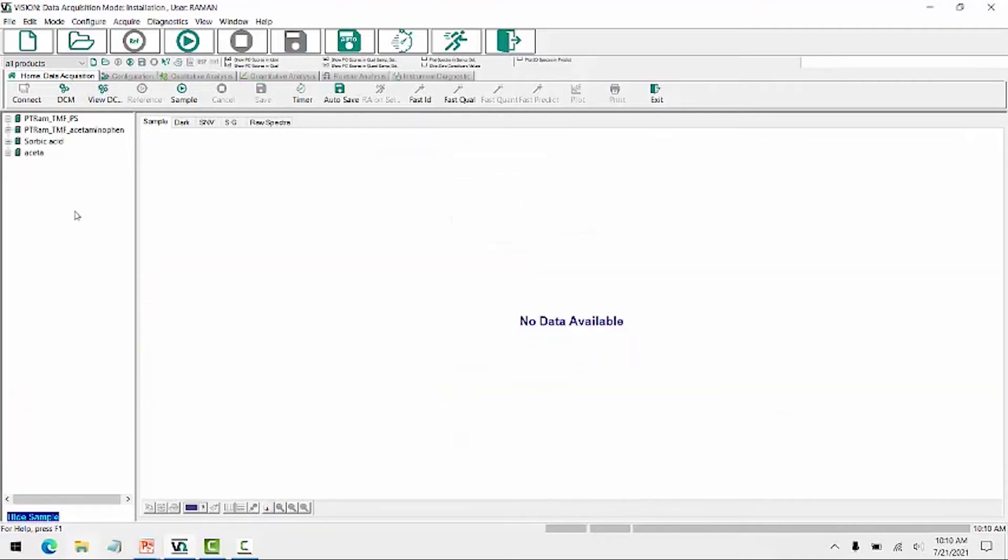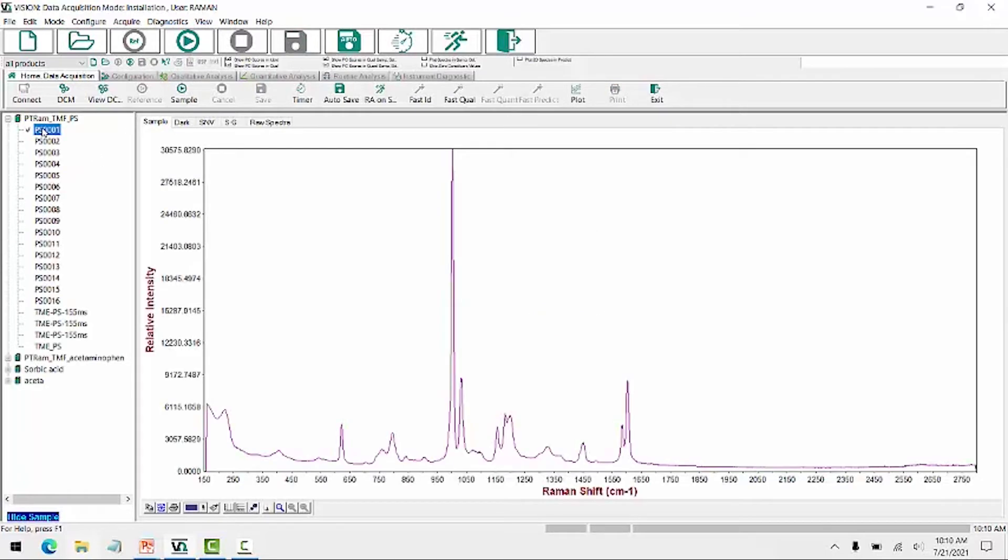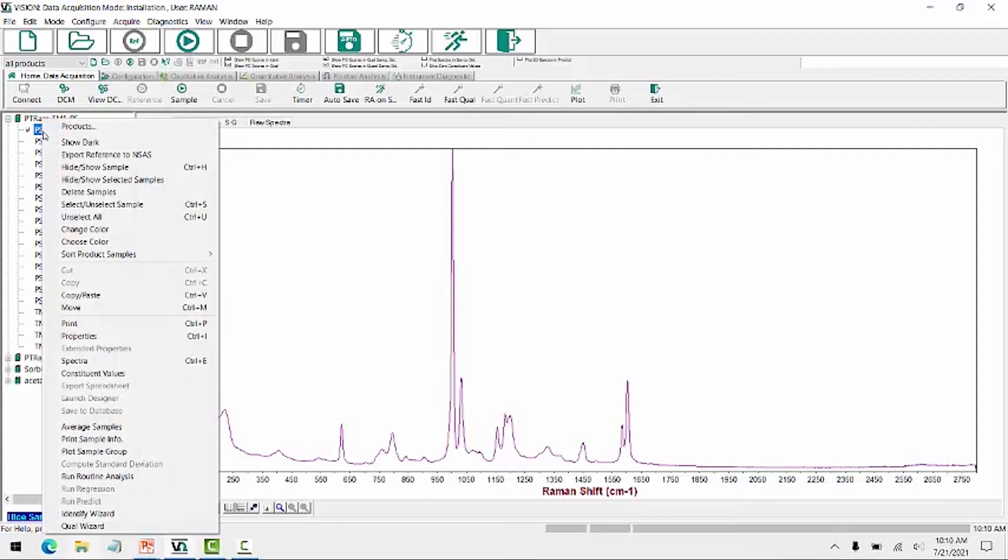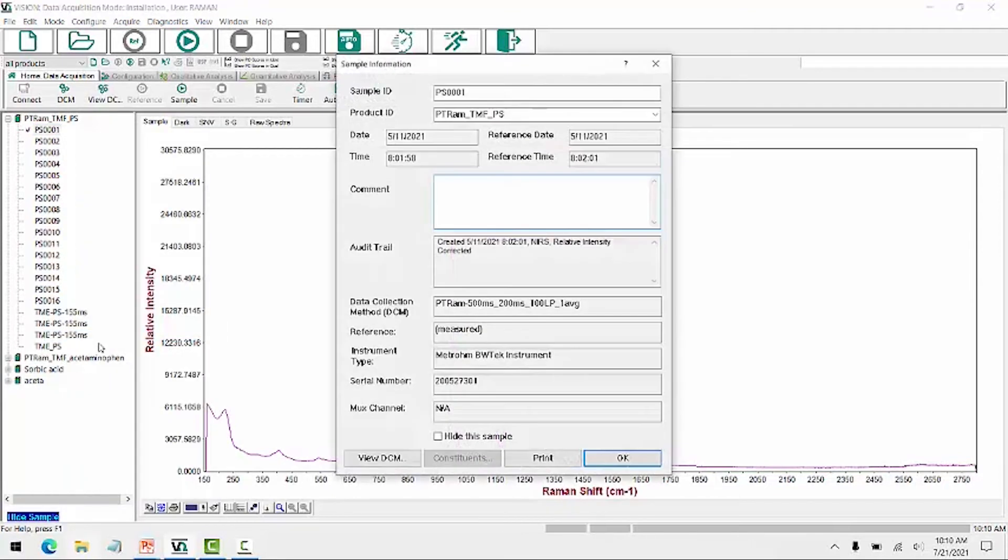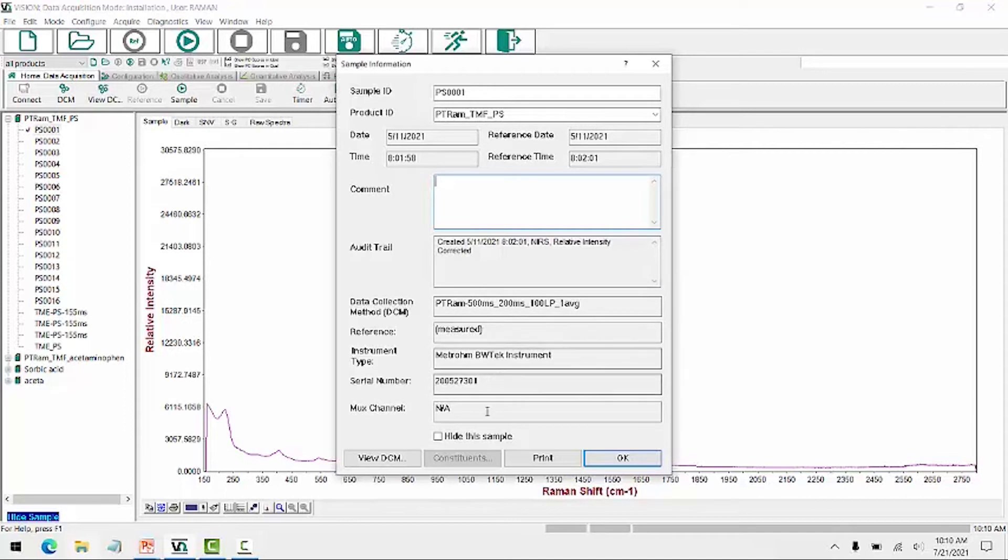Create that project, and all the information should be here. And here it is. So the information that's stored within the sample, we can take a look by right-clicking to properties, includes the information that's been saved, the date and time that the sample and its dark scan or reference scan were collected.